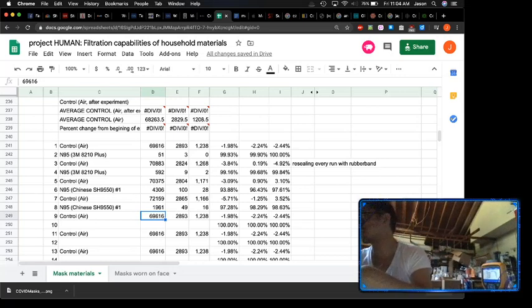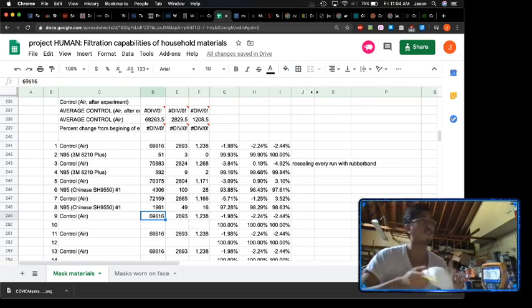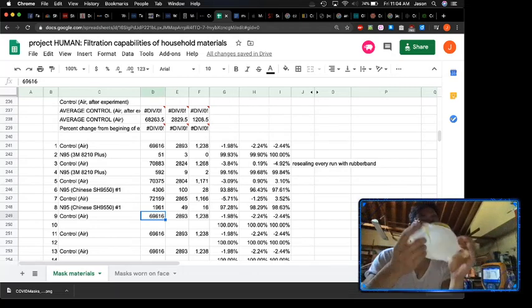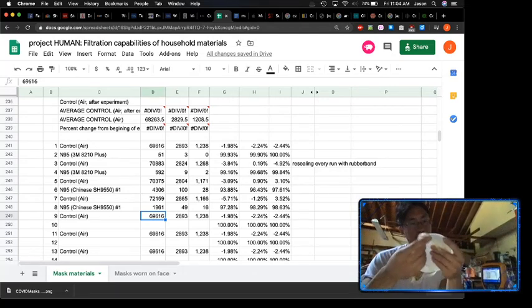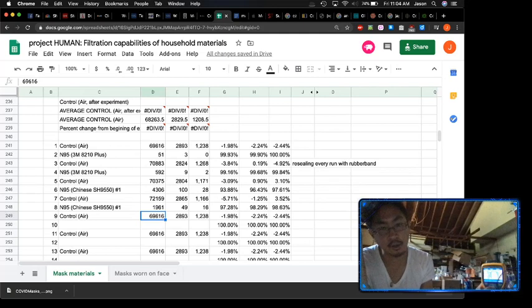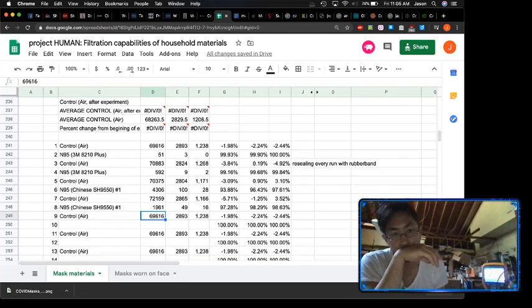Let me try another sample. So, fresh new sample. He sent me 5 of them. I think I'm gonna just seal it as tight as I can. So let me do a control. In that last run, it was 97% effectiveness, so that was good.